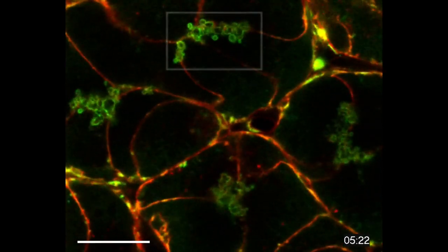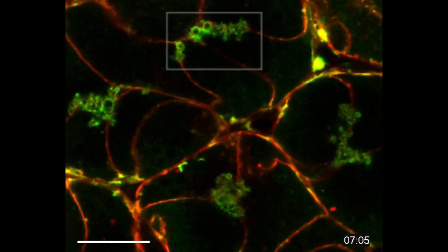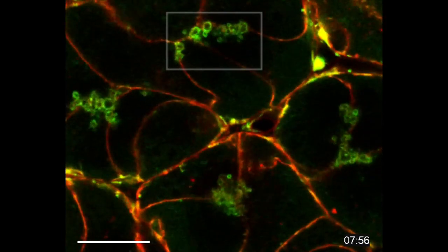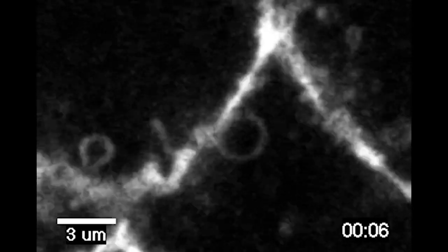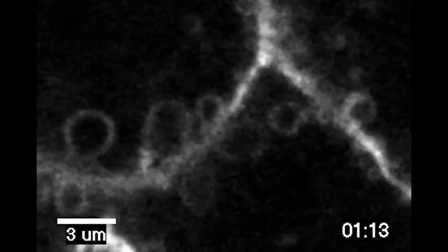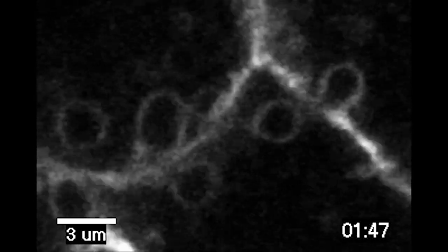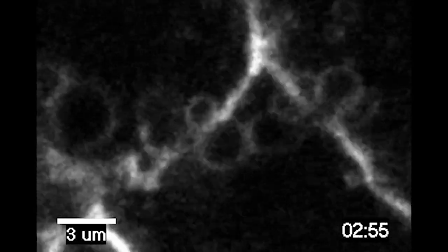If you focus on the inset in this movie, you can see the secretory vesicles in the pancreas that fuse with the plasma membrane and become rapidly coated with F-actin before their integration. When we take away actin using a drug that does not allow the formation of the filaments, the vesicles do not integrate into the plasma membranes. Instead, they begin to grow and get stuck at the plasma membrane.